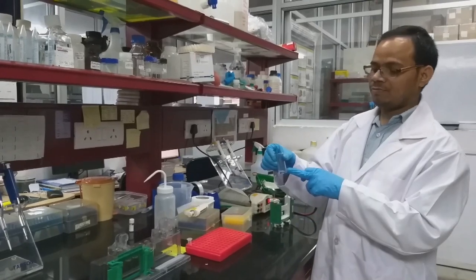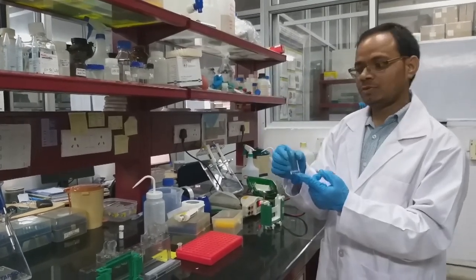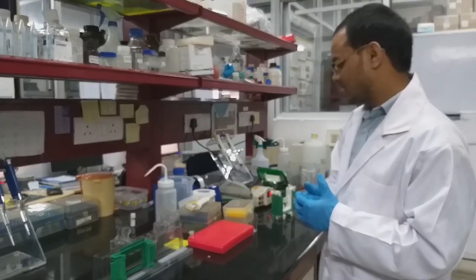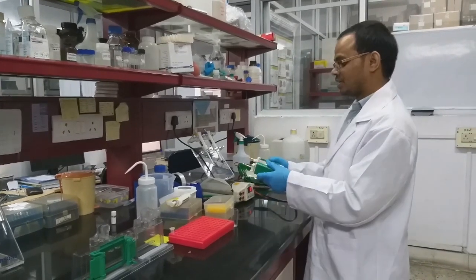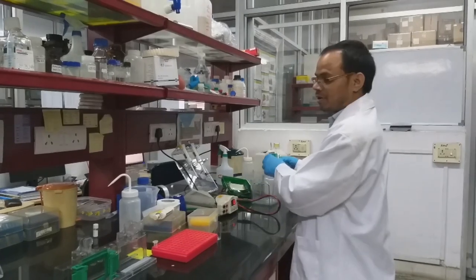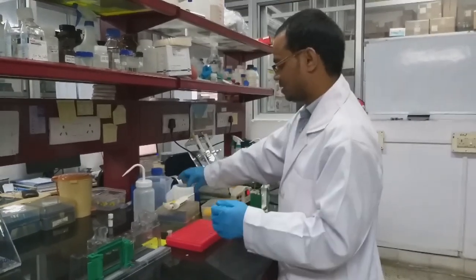This is the remaining stacking gel solution. So we can see it is solidified. That means the stacking gel also got solidified. We have to remove that gel and fix it into this one, and we have to keep it inside the tank. So I just take out the gel.